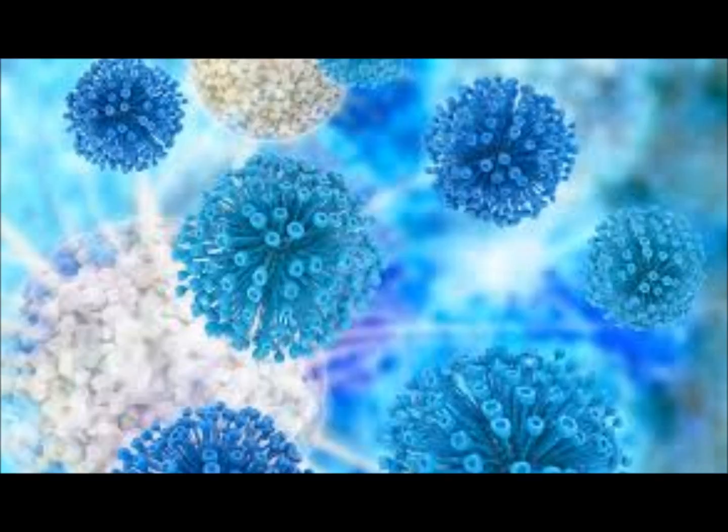Number 40, what is the best way to handle a specimen for a culture? Common sense, what do you think is the best way? Process immediately. If you can in any way get it set up immediately. Even when we did micro at our lab called TriLab in Collinsville, if we got a spinal fluid, we'd set up the gram stain and we'd plate our stuff immediately, put it in the holding area till the guy could come and transport it to Collinsville. So process anything immediately if possible.